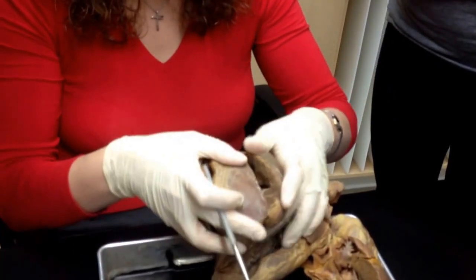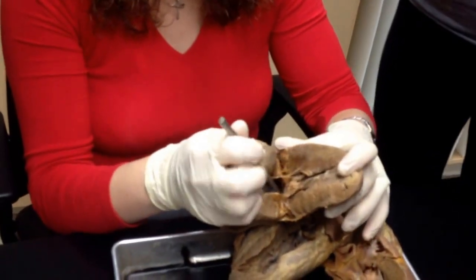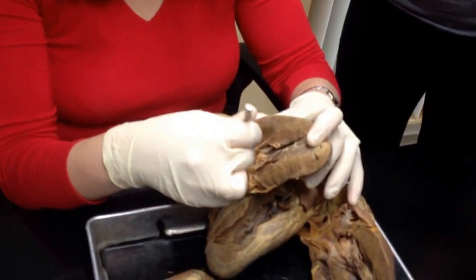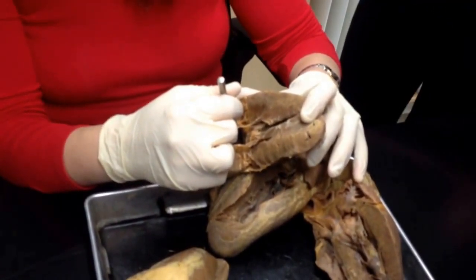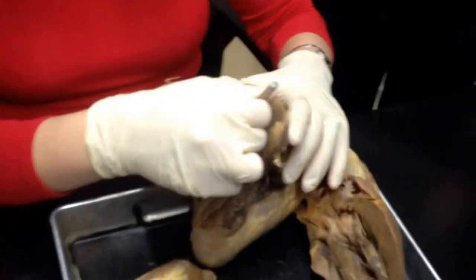Now on the other side, we have the left ventricle here, and that would make that the bicuspid valve. Then where the pointer's inserting is the left atrium. All right, so now, moving on ahead.